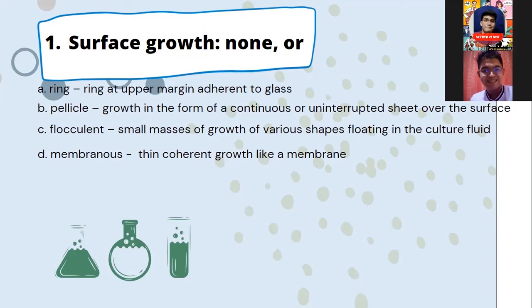In broth, different organisms will demonstrate distinct growth properties. Some organisms will disperse equally throughout the broth, while others will sink to the bottom and produce a sediment, develop in clumps generating flocculent growth, or float on the top, making a pellicle.